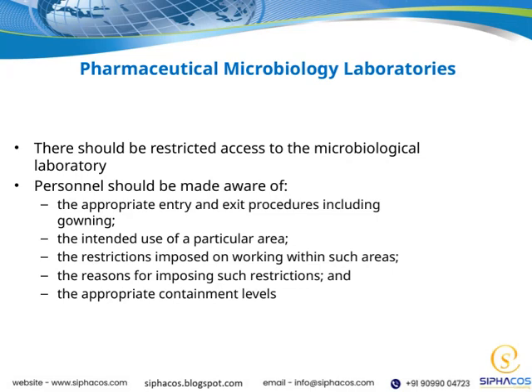Now, let's talk about pharmaceutical microbiology laboratories. It's crucial to remember that access to these laboratories should be strictly restricted. This is to ensure the integrity of the work and to prevent any contamination or accidental exposure. Personnel working in these areas need to be fully aware of the proper procedures for entering and exiting. This includes gowning protocols, which are essential to maintain a sterile environment. Knowing the intended use of each specific area helps in understanding why certain precautions are necessary.